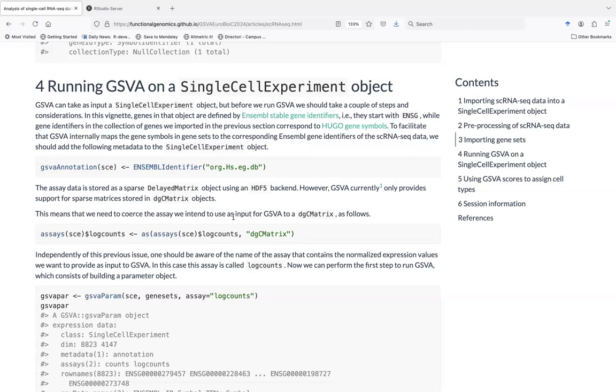The mapping is done in the direction of changing the genes in the gene set to the standard of the molecular data. The molecular data is untouched. You have the same number of rows. Why? Because changing the genes in the gene set is not dramatic. You have a gene set that grows by a gene or loses a gene, it's the same gene set, okay?